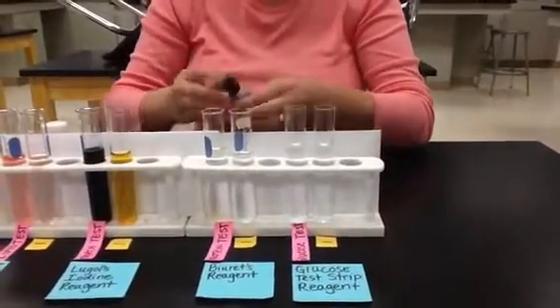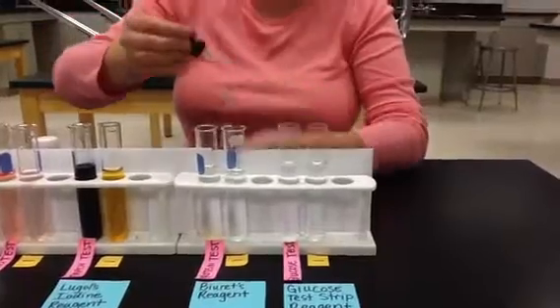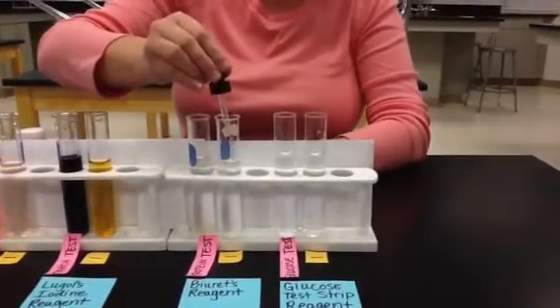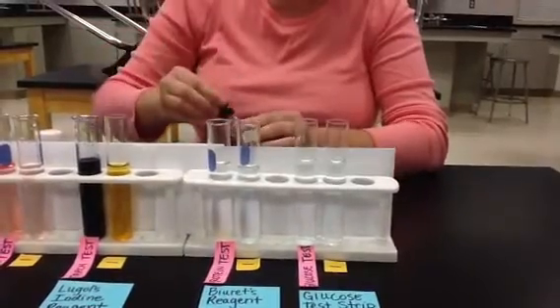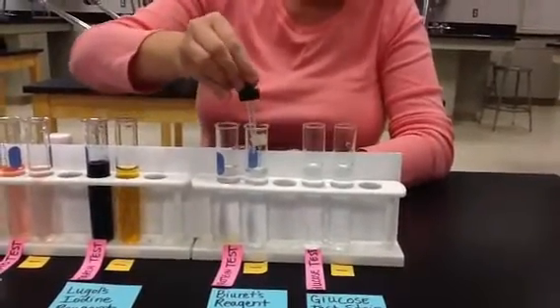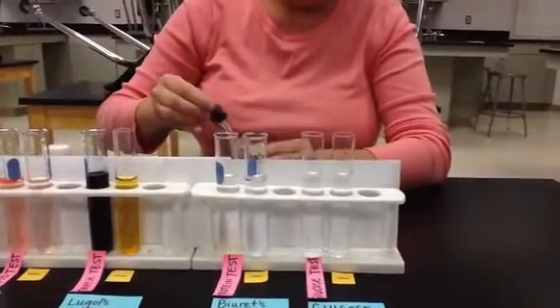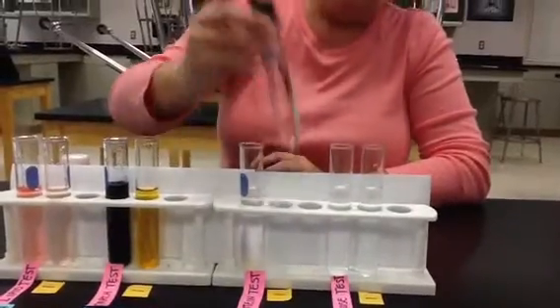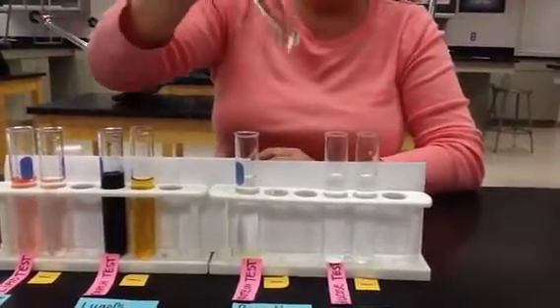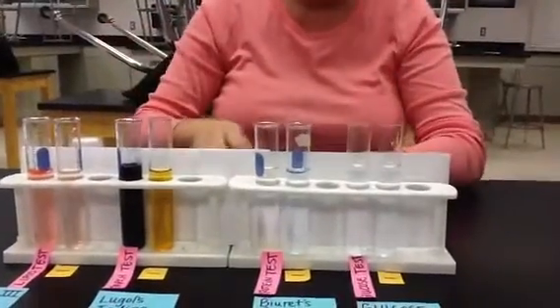So we'll start with our negative test first. And we have to add quite a bit of this to really see the reaction, so you might see me add quite a few drops, and you may have to do the same thing for your own test. Hopefully we got enough. Okay, so that's our negative test. Basically it should stay either pretty clear or maybe a light blue. And that's pretty much what we see.